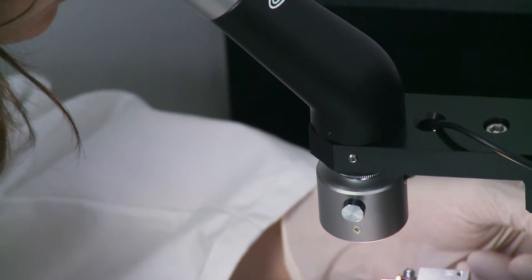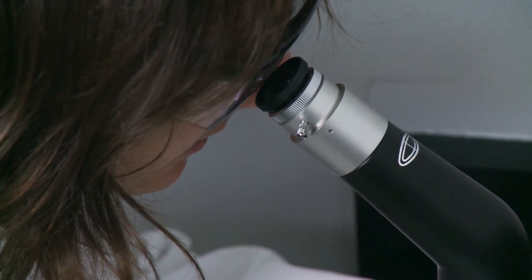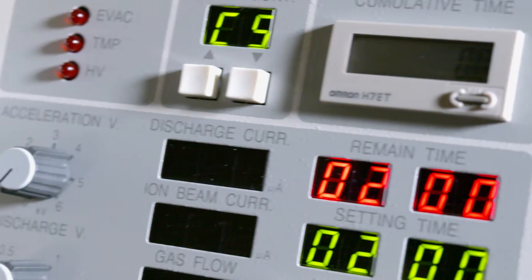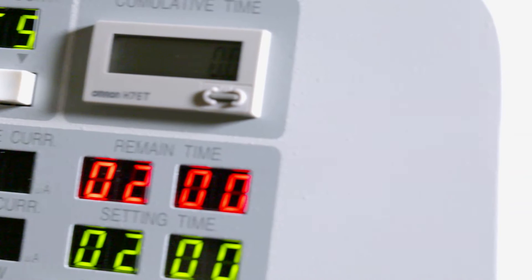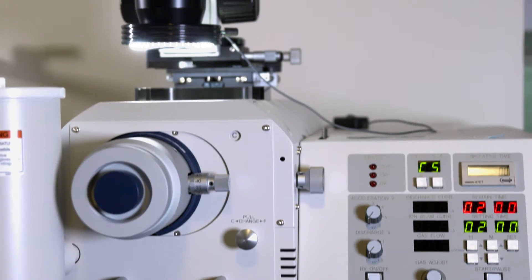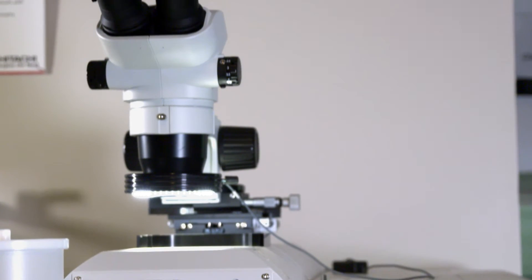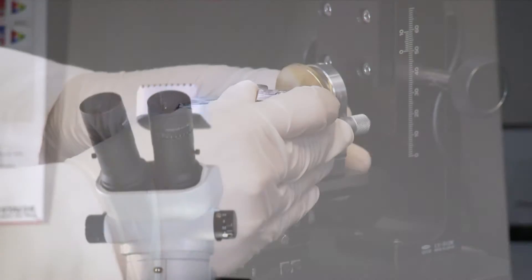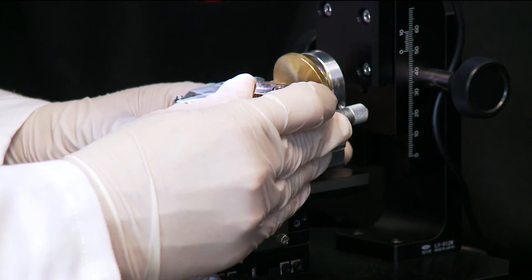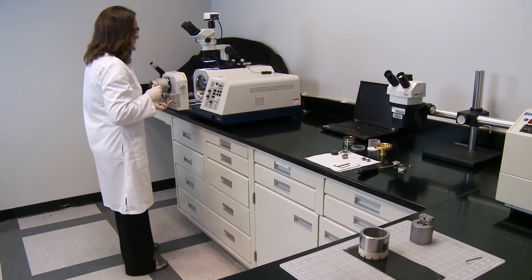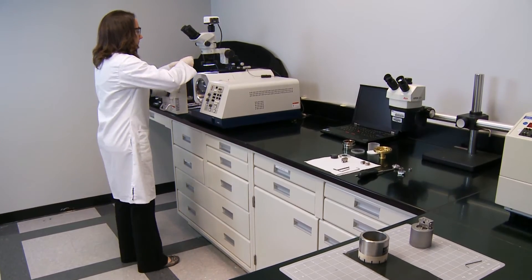Artifacts tend to be visible the first few micrometers after mechanical polishing. However, such artifacts are not introduced when using the Ion 4000 Plus. After the optical adjustment has been performed, the entire stage assembly, including the sample, can be placed inside the Ion 4000 Plus. This method keeps the sample and milling position locked even after sample removal.